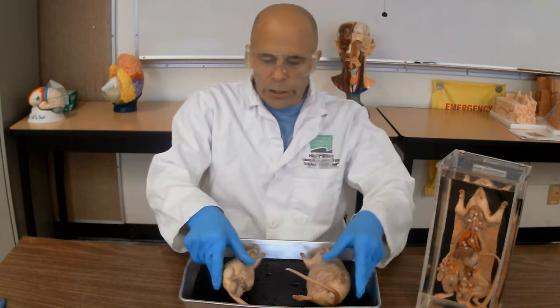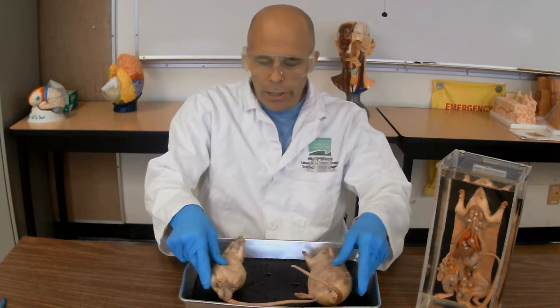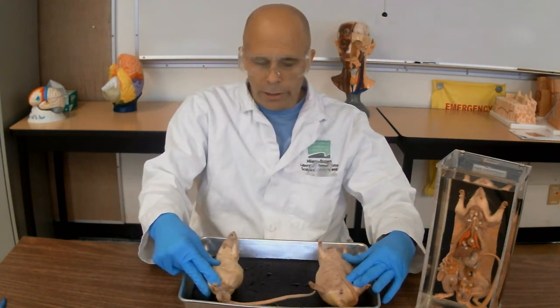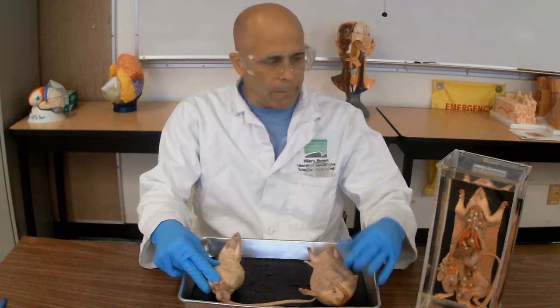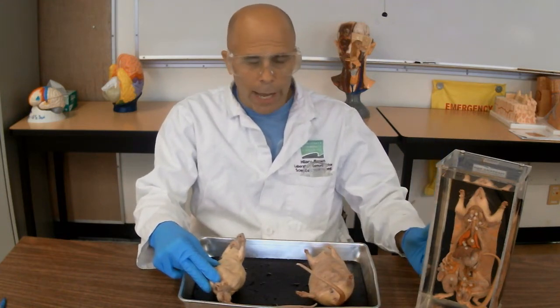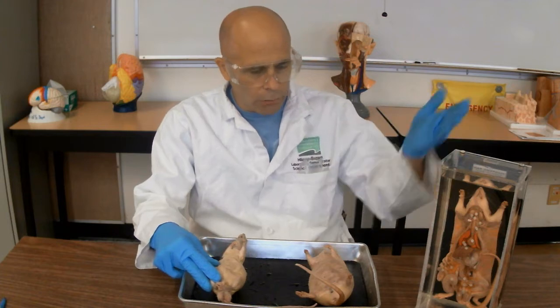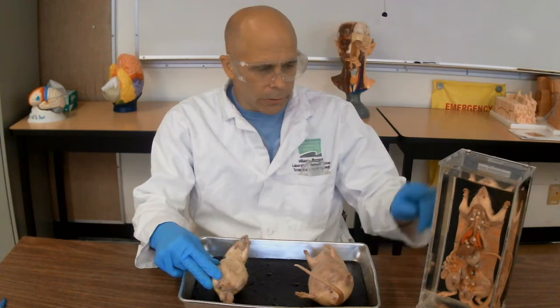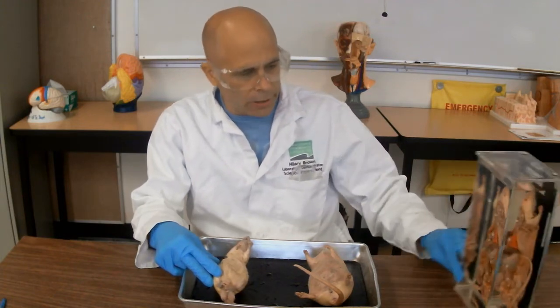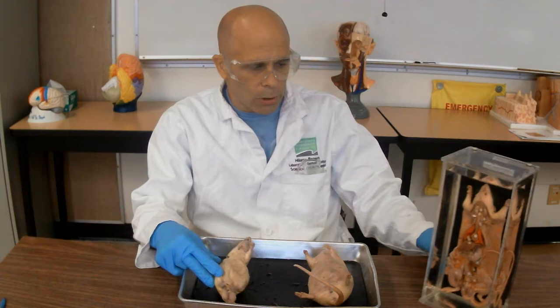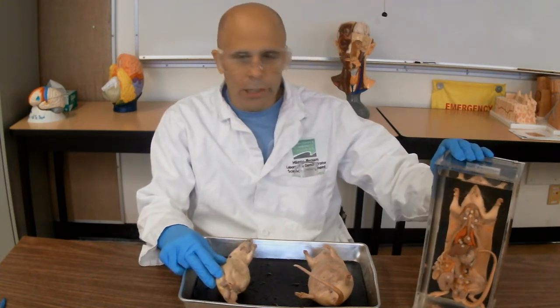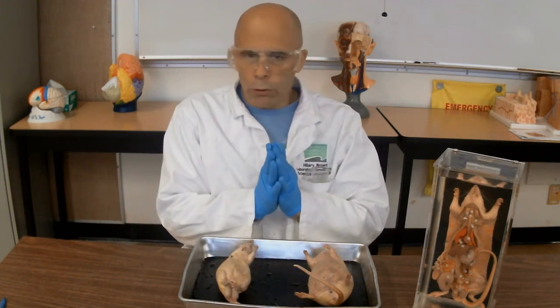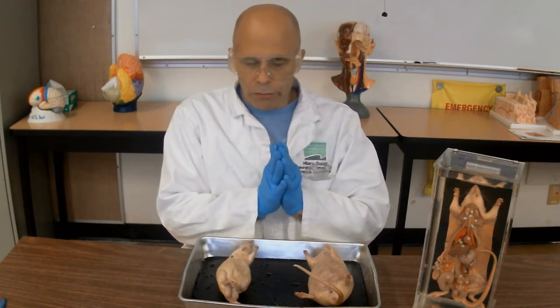I have placed two rats in my dissection tray — you can see that they're quite different; one is larger than the other. I also have a pre-dissected rat in a jar under glass, which has been injected with colors so that you can see the internal anatomy of this animal more clearly. It's too bad you can't be here in class with me today to see this, but I will do my best to demonstrate all of the parts.